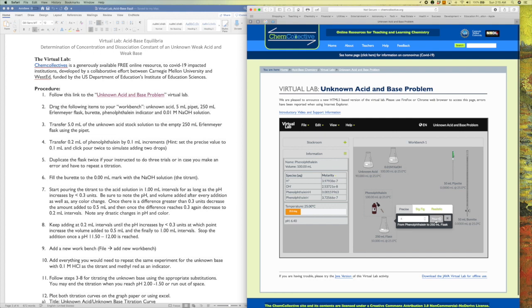And when I do that, see now that the volume of the flask has gone from 10 ml to 10.1 ml, because now there is 10.1 ml of solution in this flask. So that was 1 drop, but I usually add 2 drops for titrations, and you don't need any more than 2 drops, but 2 drops is nice.